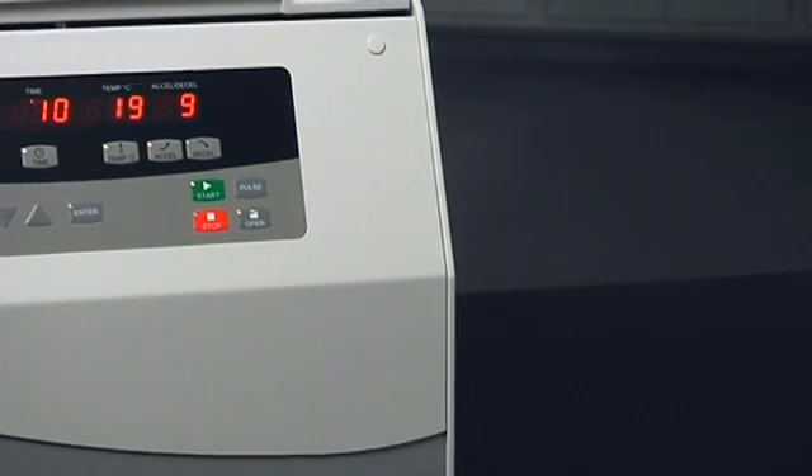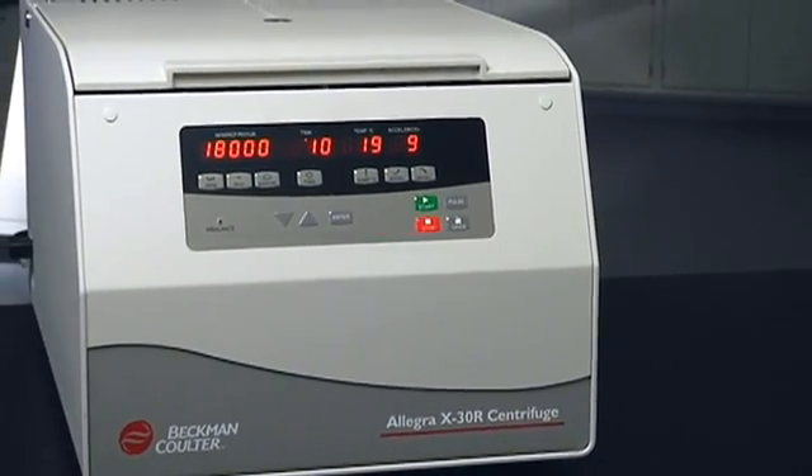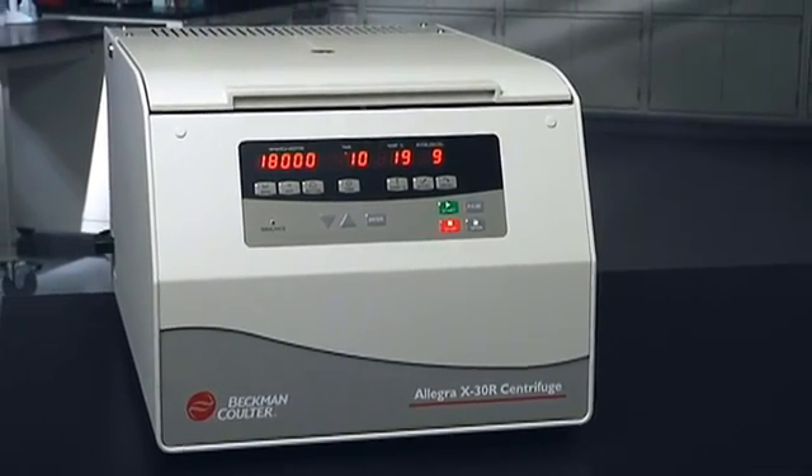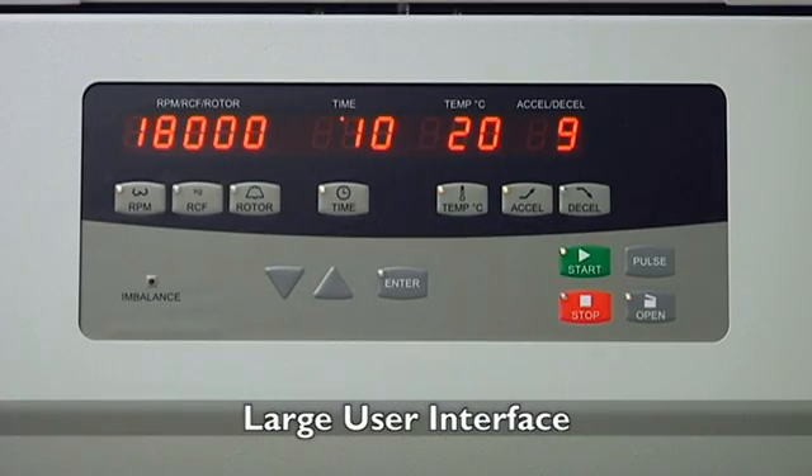Featuring a large streamlined user interface, operation of the Allegra X30 is simple and intuitive, making your time at the bench efficient. The Allegra X30 interface is easy to see from anywhere in the lab.